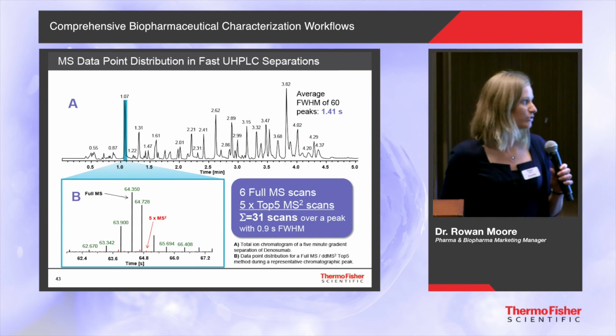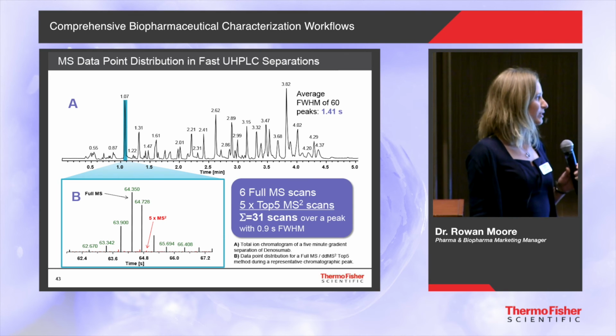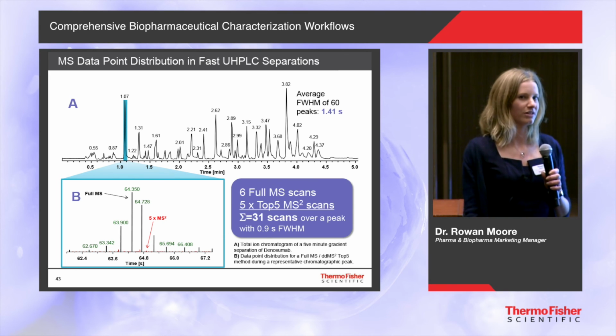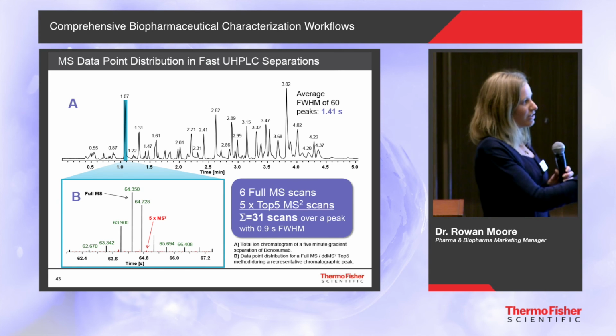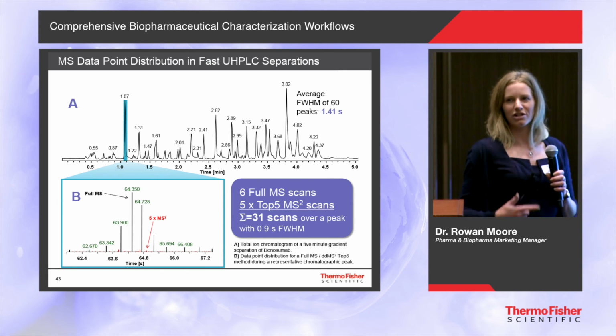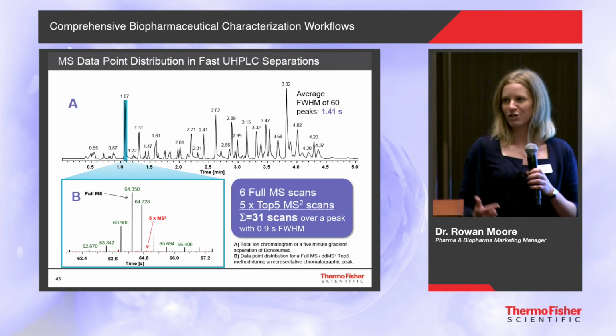So the next thing, if you speed up your peptide map to 5 minutes, is to think about the detector. We've now got a really fast separation, 100% coverage, but how fast was the detector able to keep up with that? Were we able to get sufficient scans?